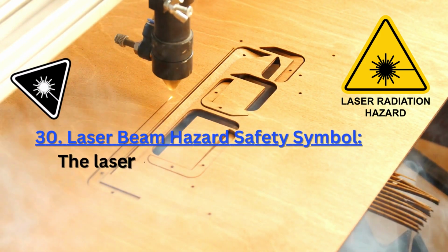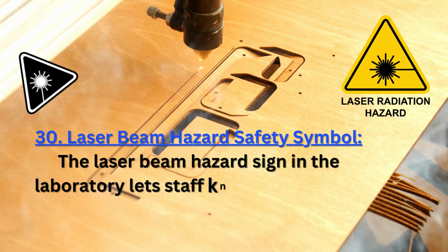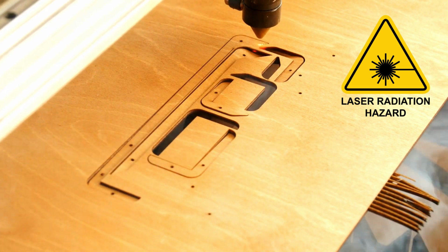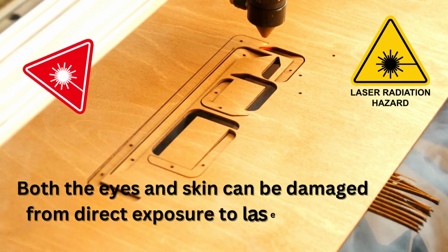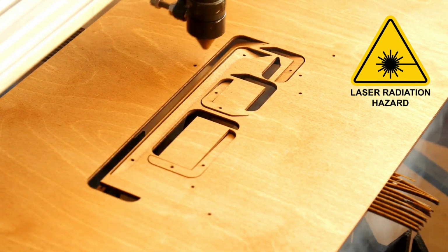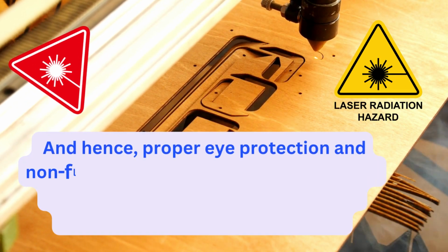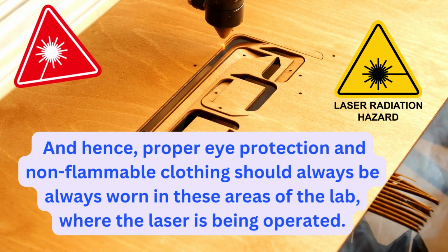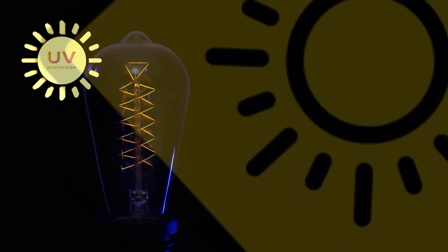30. Laser beam hazard safety symbol. The laser beam hazard sign in the laboratory lets staff know that hazards from laser beams are present. Both the eyes and skin can be damaged from direct exposure to laser beams. Hence, proper eye protection and non-flammable clothing should always be worn in those areas of the lab where the laser is being operated.